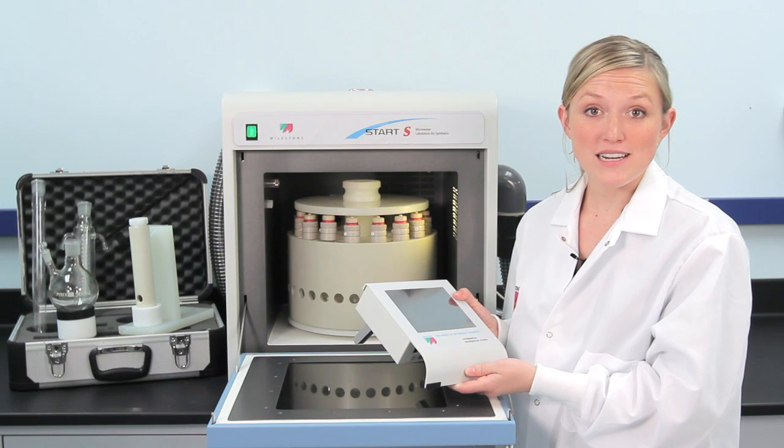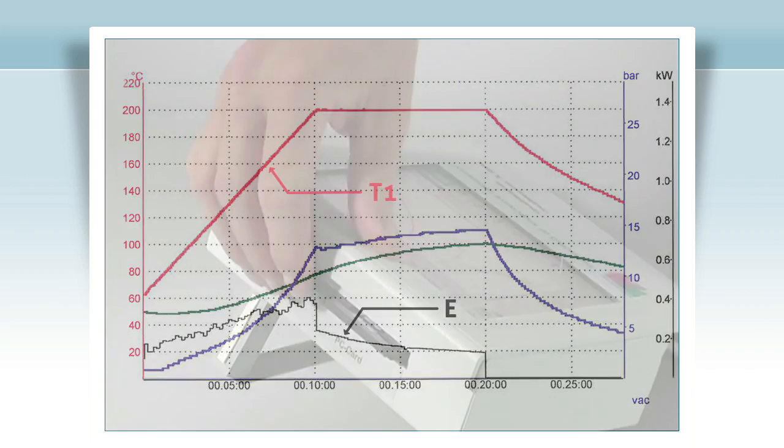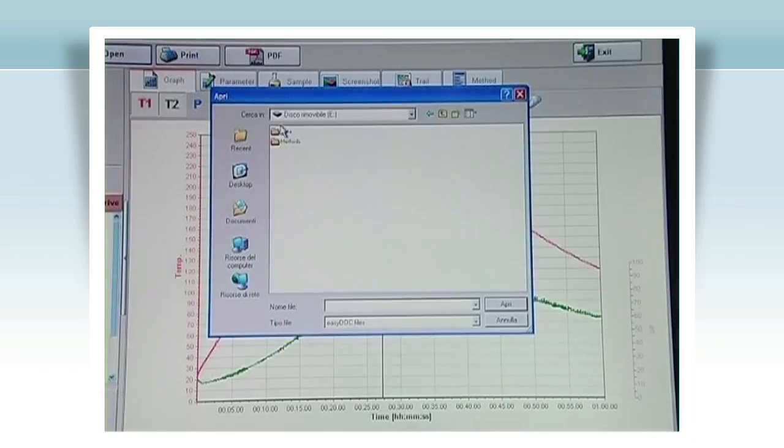When the program is running, a real-time display showing actual temperature and applied power is shown. When the run is complete, store the method and it can be recalled at any time.